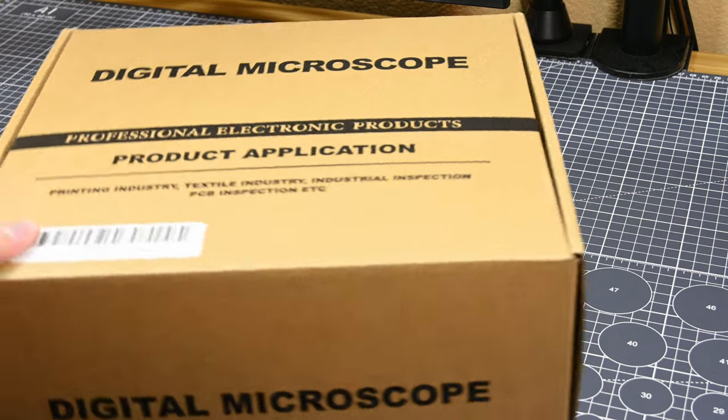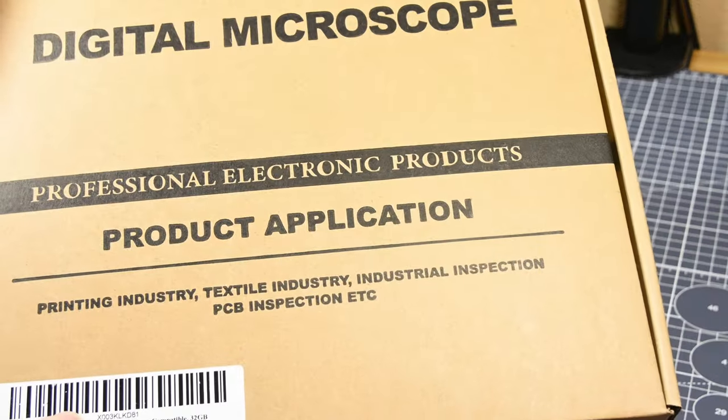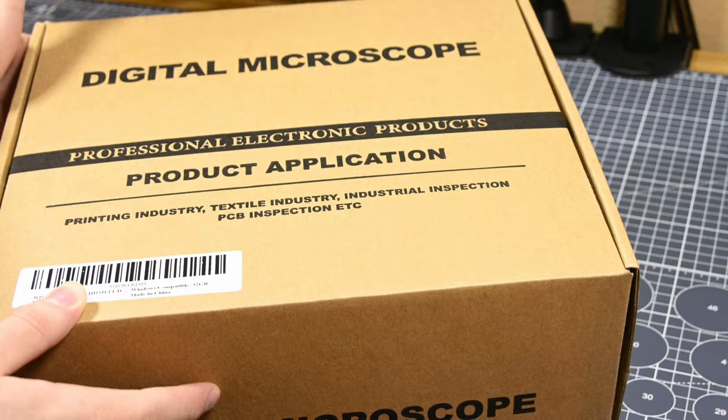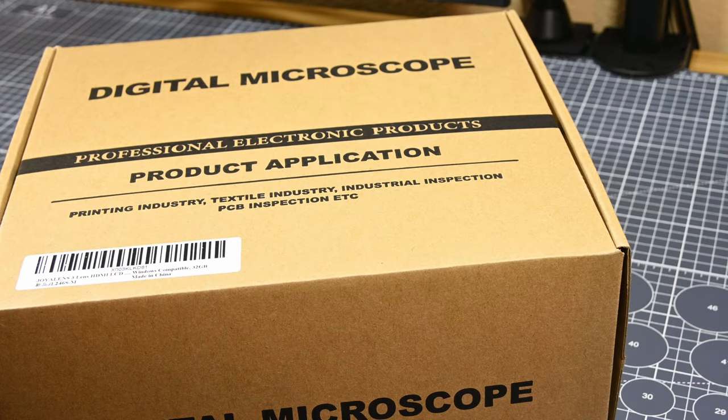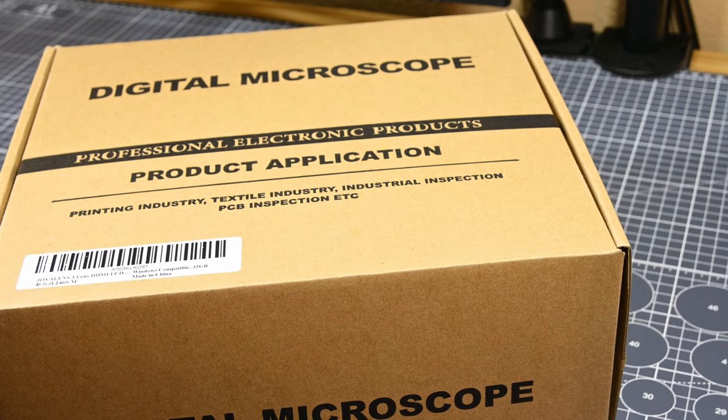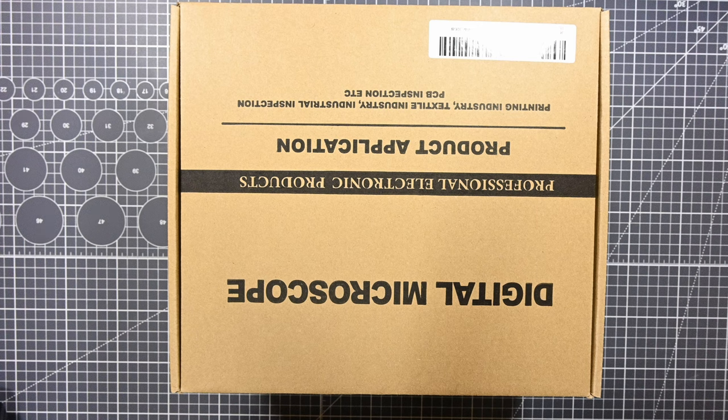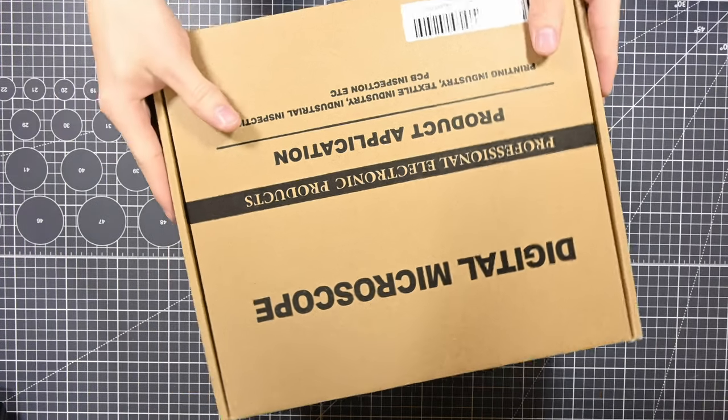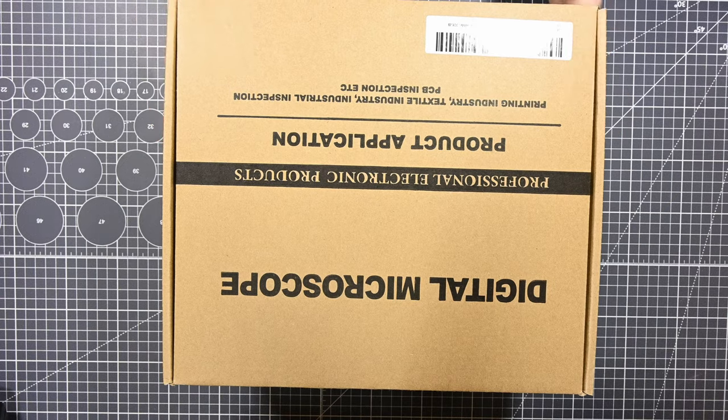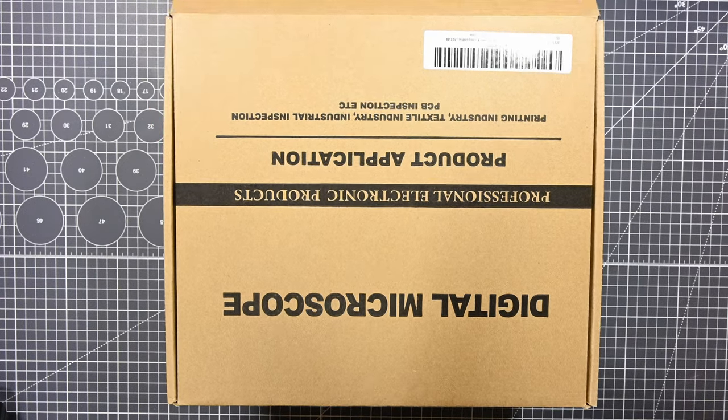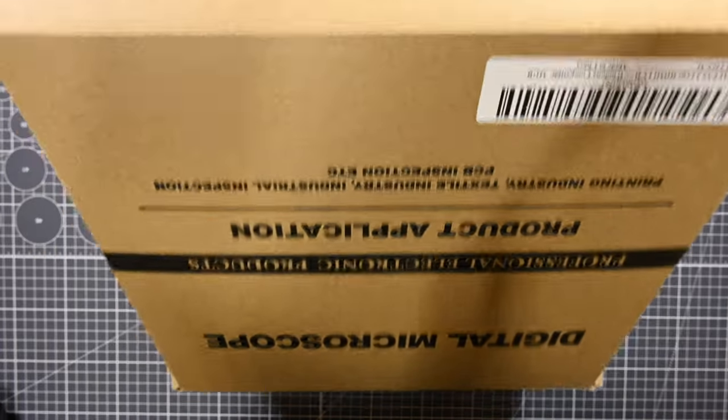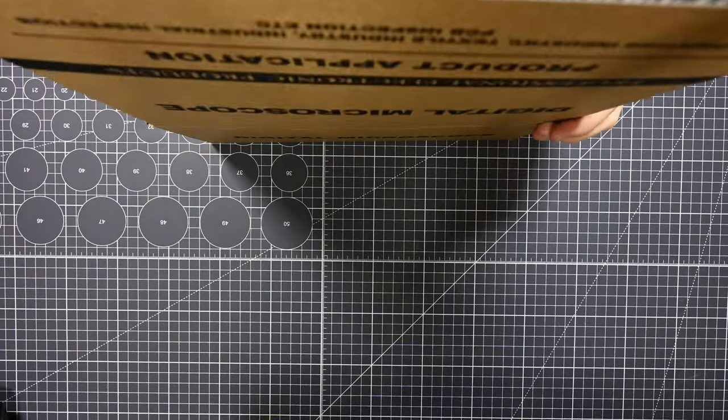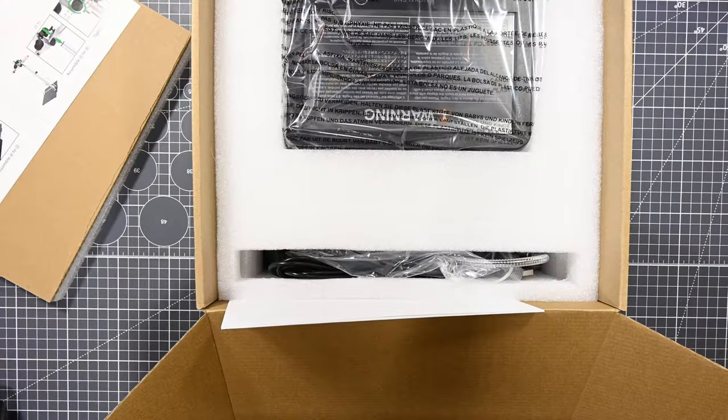Recently, a company named Joya Lens reached out to me and offered to send me their JL246MS digital microscope for a review. To be fully transparent, Joya Lens did send me this microscope for free and I will be keeping it after making this review video. Other than that, I will not be receiving any kind of payment and I intend on giving my completely honest opinion on this microscope as someone who's just now getting started with digital microscopes such as this one.